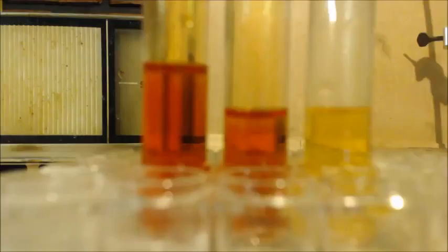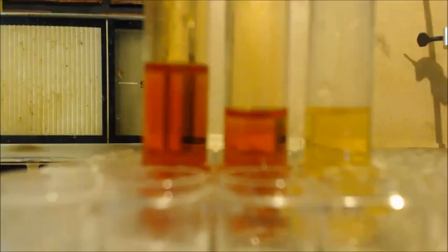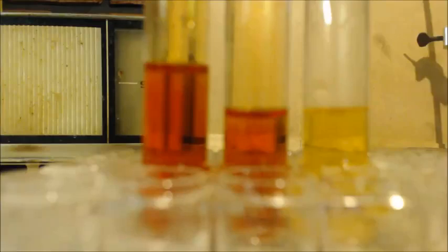See, there's the liquid that came over. Should have put that in an ice bath. At the very end, there was a little bit coming over of the alcohol. But I just wanted to show you the three different colors. Although on camera, these two kind of look like the same color. But this is actually red, this is orange, and this is yellow.